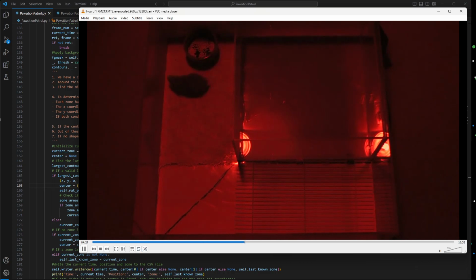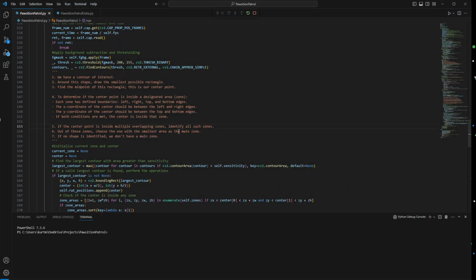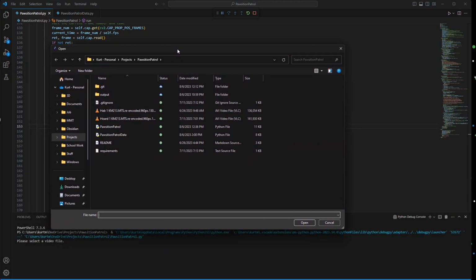entered into this habitat. So over this 10-minute clip, you can see the hamster just wanders around. But we need to quantitatively know when and where this hamster was spending its time. So I went ahead and made a program to try and aid with that. So we'll go ahead and run that now. It's just a Python script using OpenCV for the background subtraction.